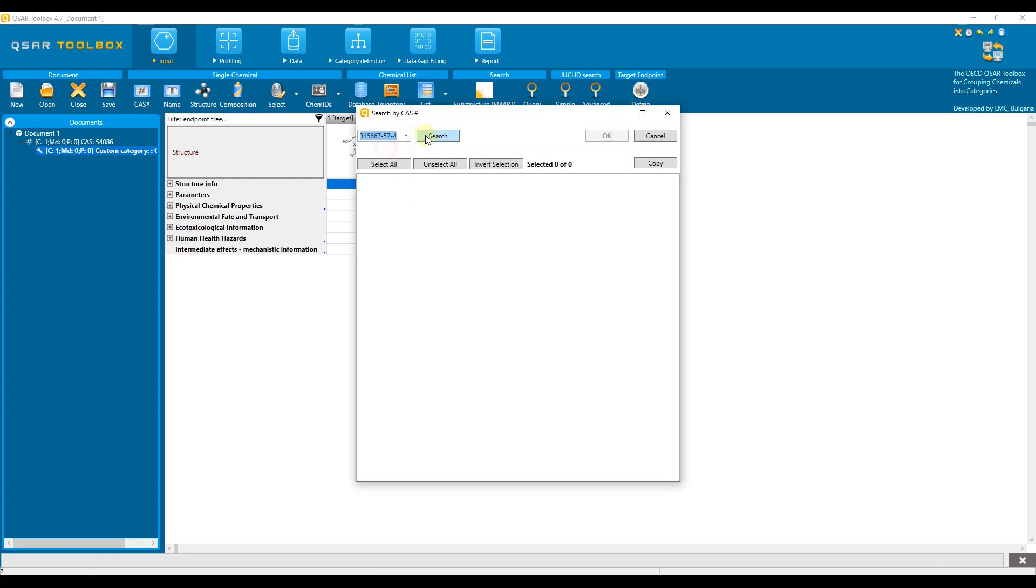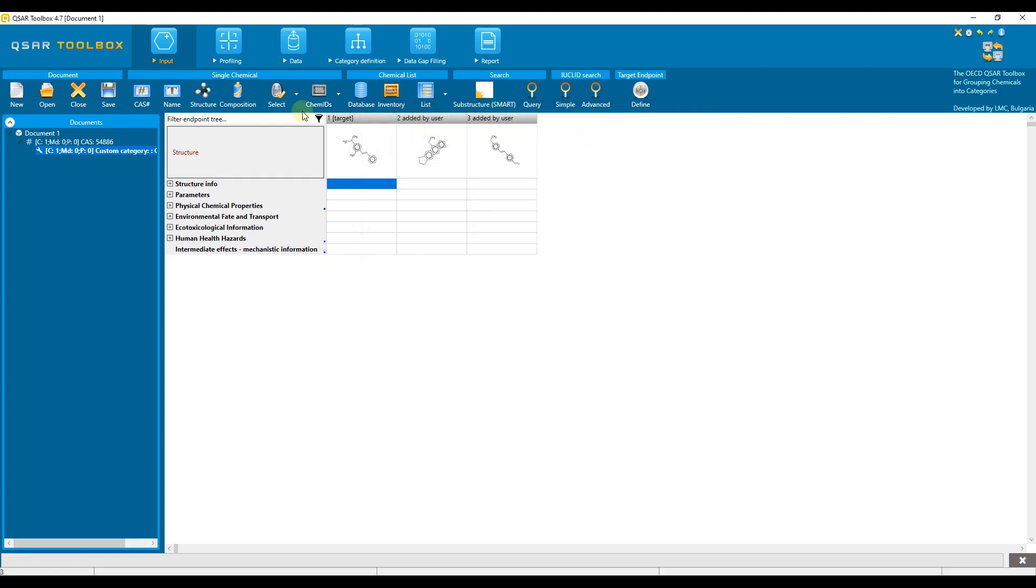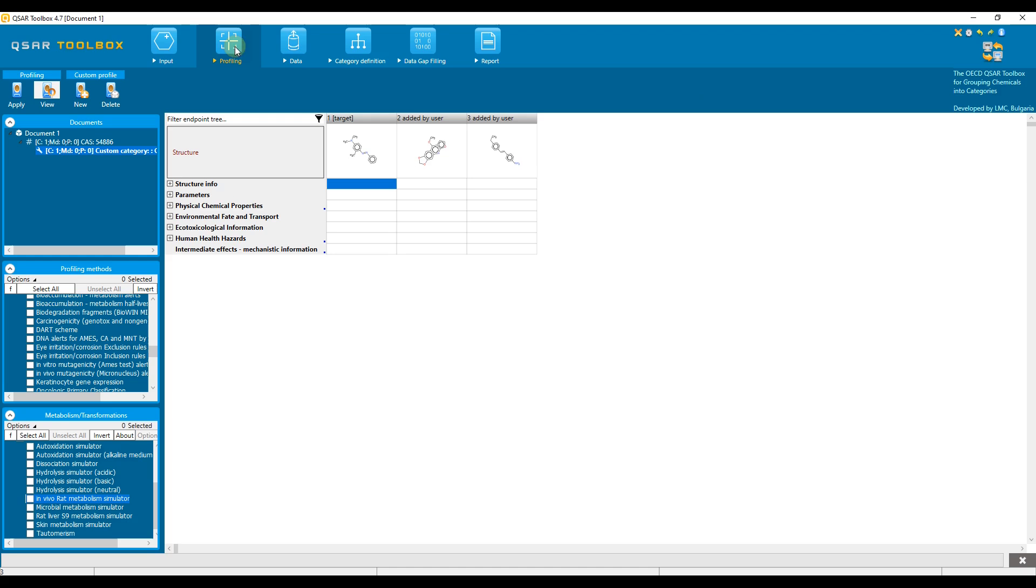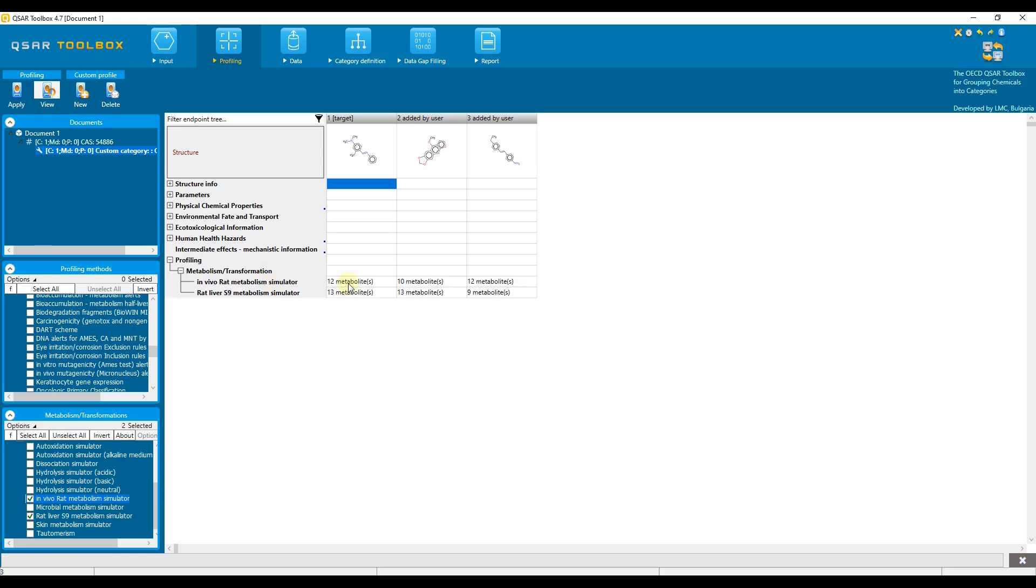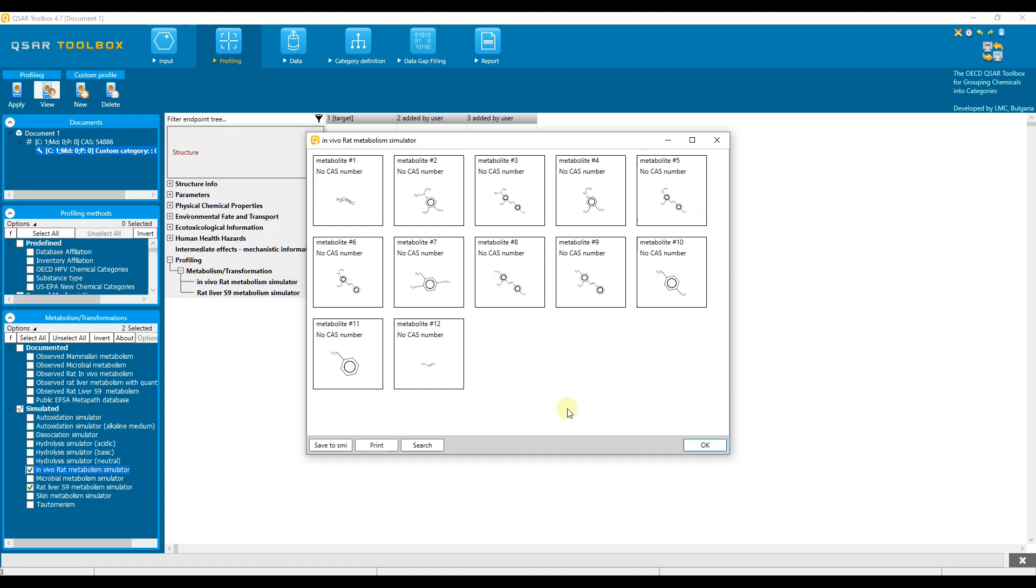We need to go to the profiling module and select two simulators from the list, the in vivo rat metabolism simulator and the rat liver S9 metabolism simulator and click apply. The number of simulated in vivo and in vitro metabolites of the chemicals appears as a result in the data matrix. Double-clicking on a cell with a result opens a table with the generated metabolites based on the corresponding simulator.